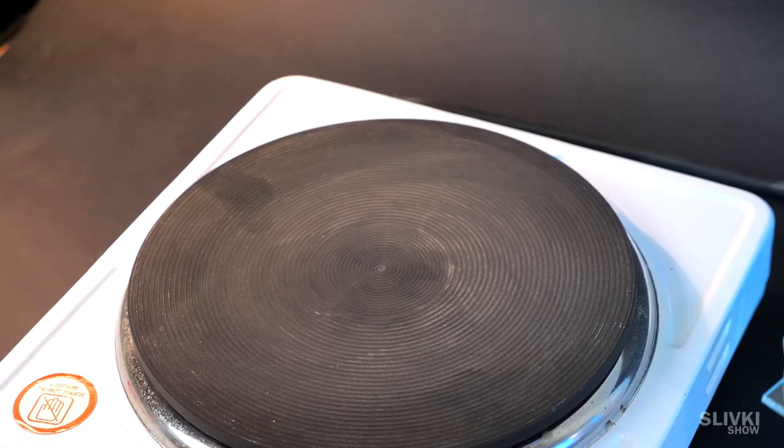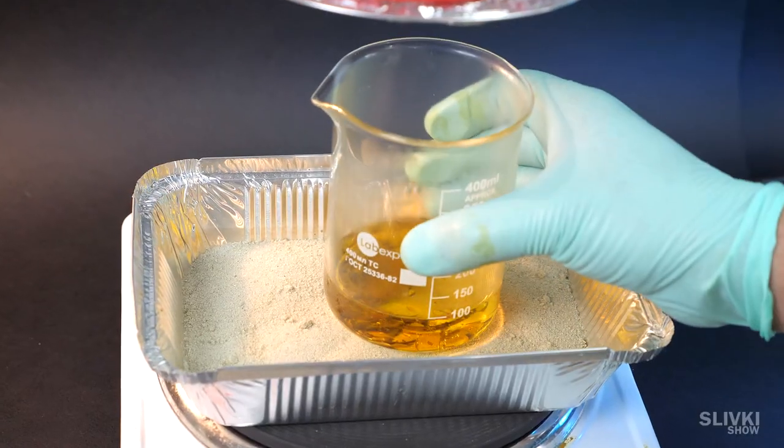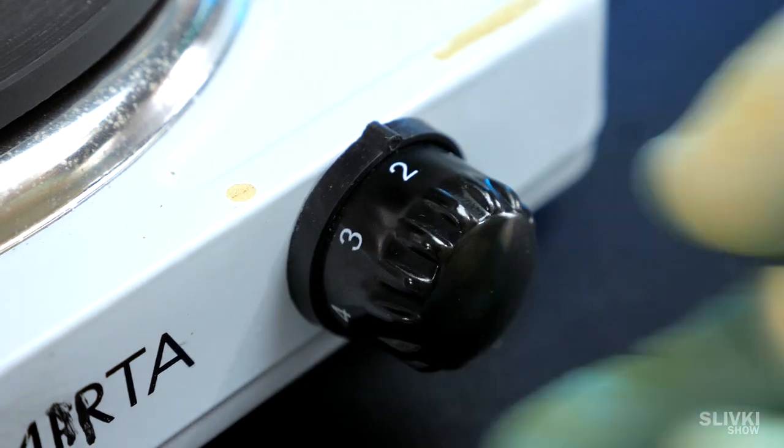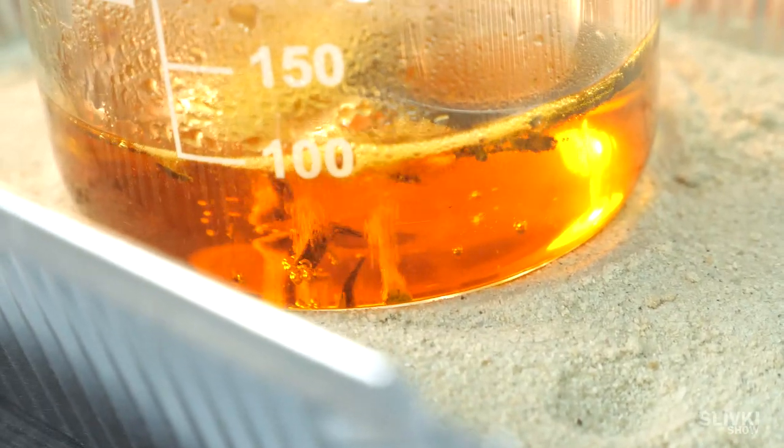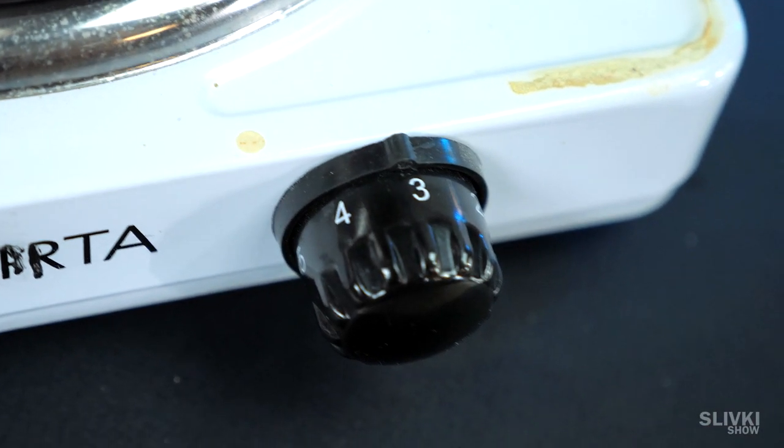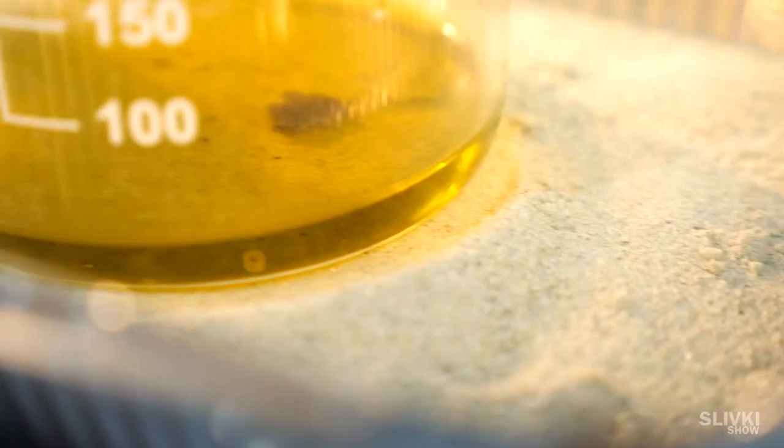For the heating process, we took a hot plate, put in a container with sand and placed the flask in the sand. When increasing temperature, chemical reactions go faster. Now we need to increase the temperature on the stove and leave the substance to evaporate until it shrinks two to three times.